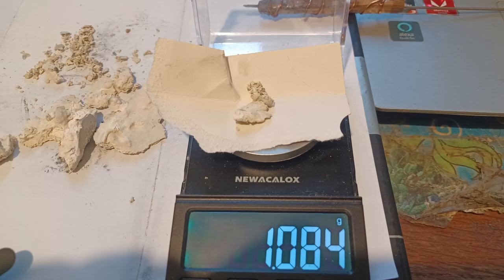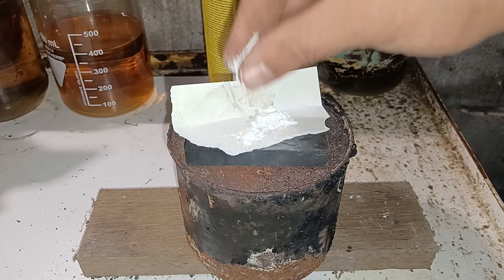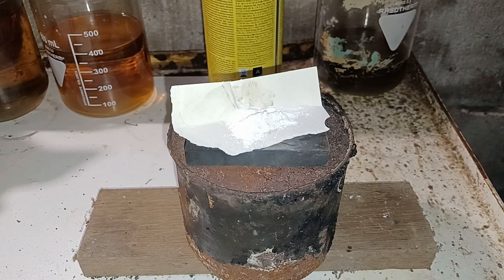The third and last thermochemical method I tested was a reaction between silver chloride and sodium carbonate. I simply mixed the two, transferred them onto a graphite mold, and blasted them with a MAP gas torch.